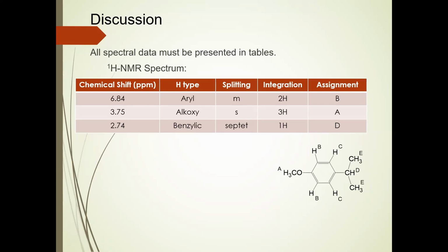So this table is actually short a couple since I only have 3 of the hydrogens shown, and also I've left out 2 of the peaks. So you could go back. This is from the spectrum we analyzed at the very beginning.